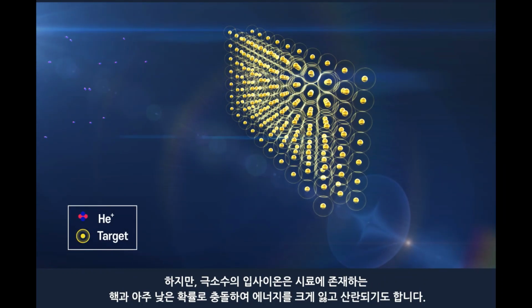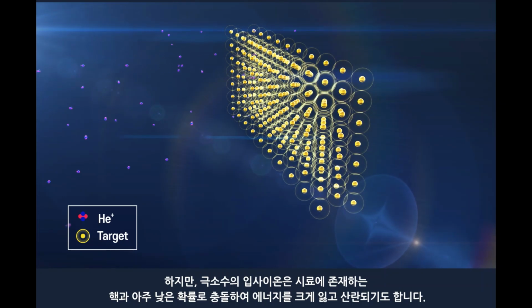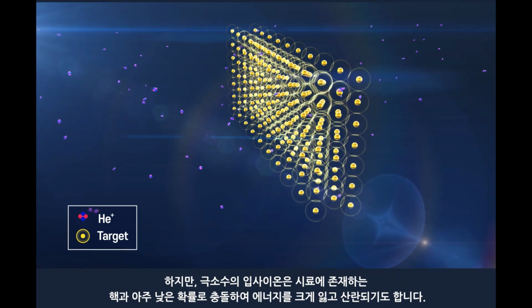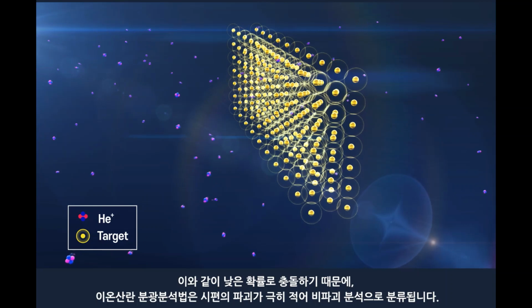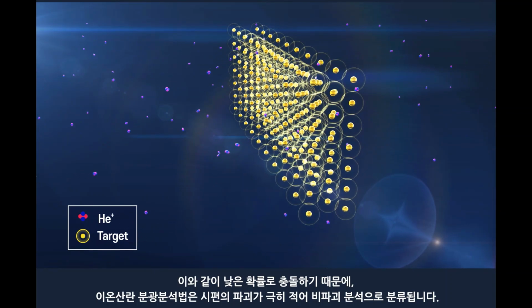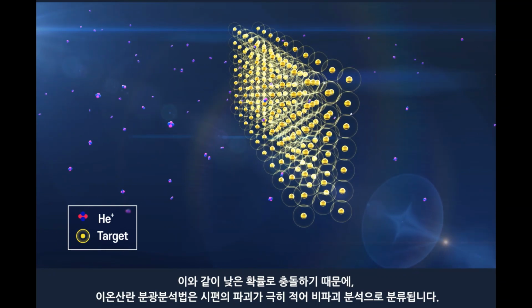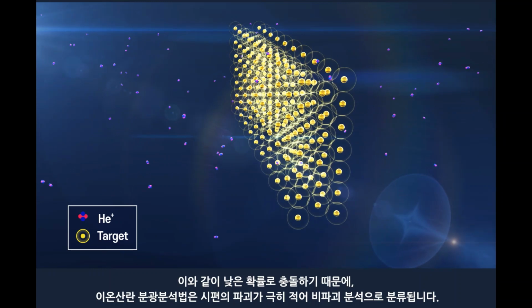However, a considerably small number of incident ions collide with the nuclei present in the sample with a very low probability, resulting in scattering and significant energy loss. In addition, because of the very low probability of collision, the sample destruction is very small. Therefore, this can be classified as a non-destructive analysis method.